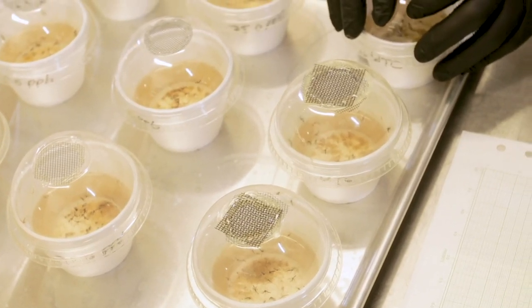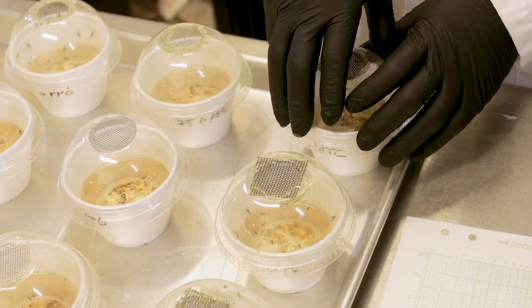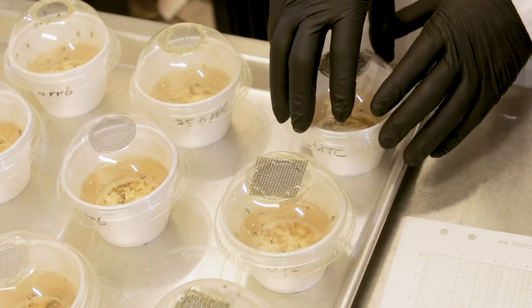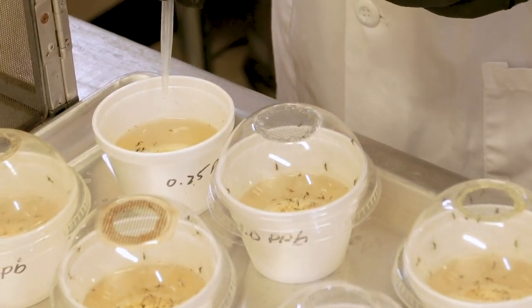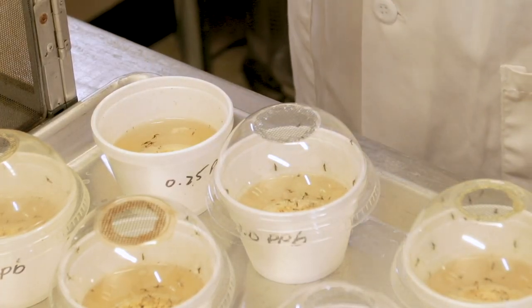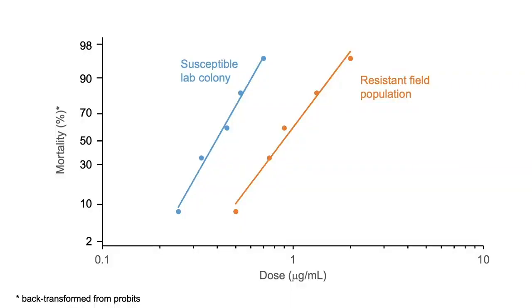Be careful not to contaminate the water in the cups of the untreated control with your control agent. Typically, you want to start processing the bioassay cups with the control, then the lowest concentration of the control agent, working your way up to the treatment containing the highest concentration of the control agent in your bioassay. Doing so will help to reduce inadvertent contamination among treatments in the bioassay.